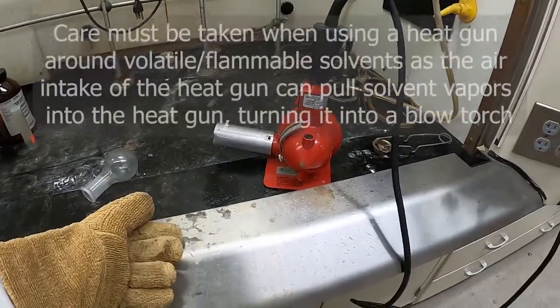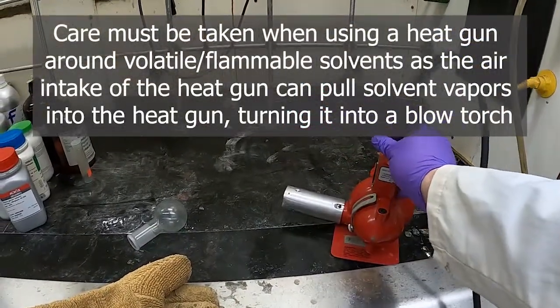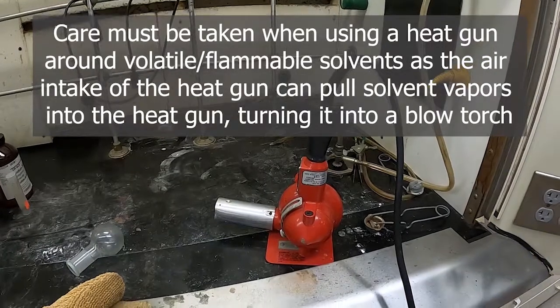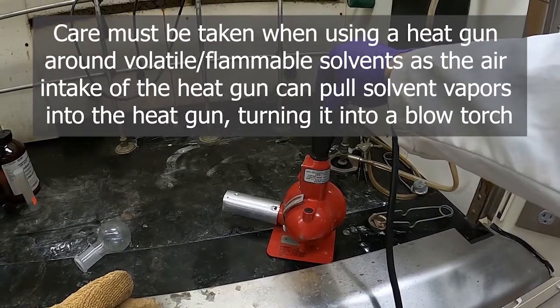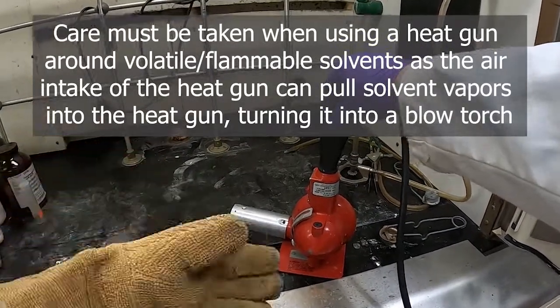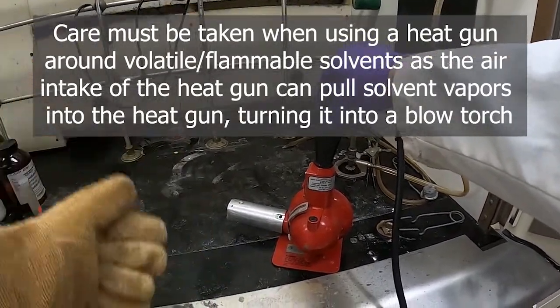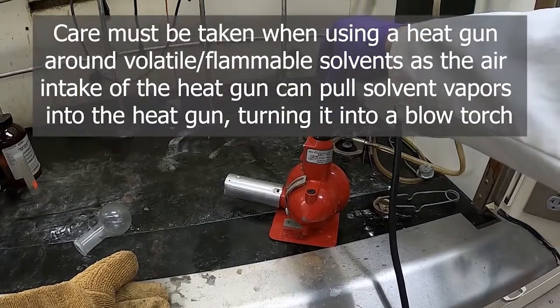It should also be noted that you should be careful using a heat gun around any really volatile solvents that are flammable, because you can quickly turn your heat gun into a flamethrower if you're blowing solvent vapors away and they're catching fire because they're getting hot enough to ignite.